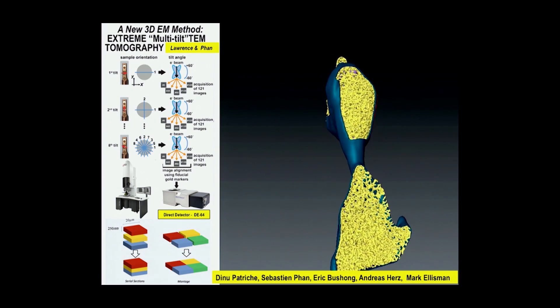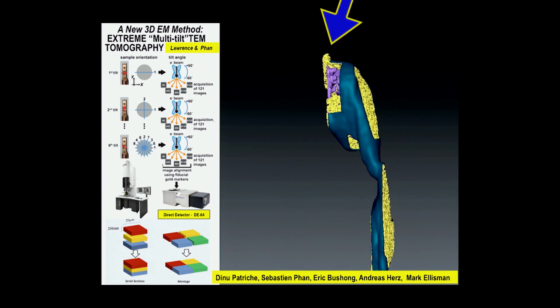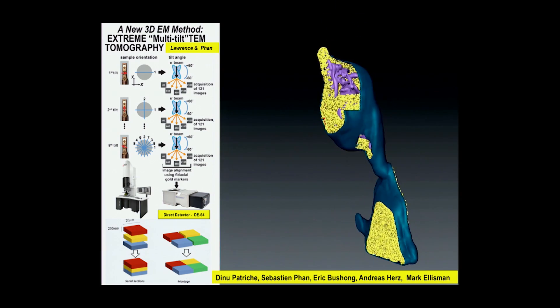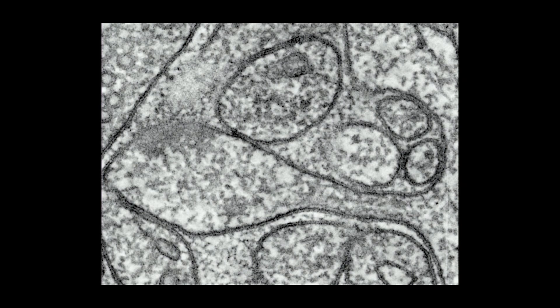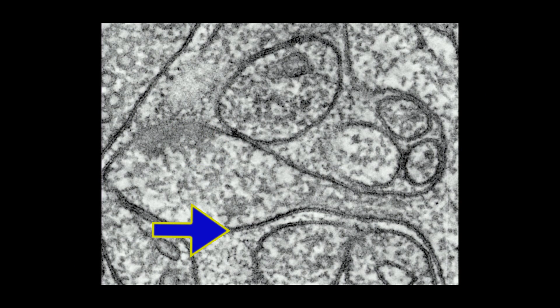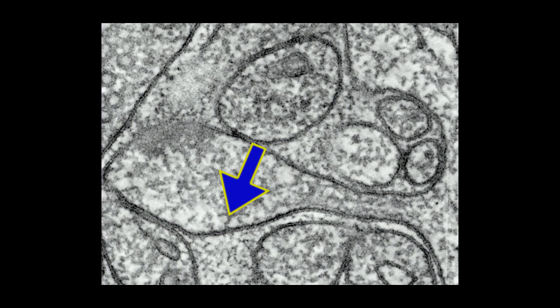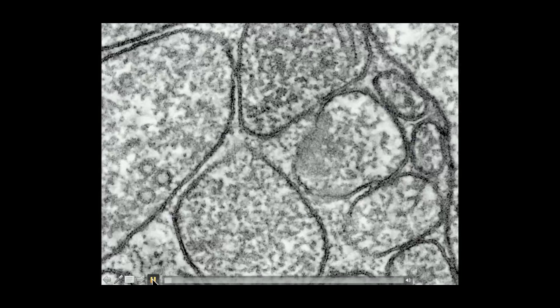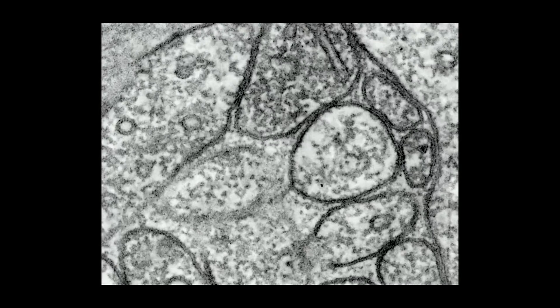If you extract the dendritic spine from that volume after using some fancy tools to follow the actin, that's what it looks like — that's the postsynaptic density, a little finger-like process probably trying to extend. Here is a more recent one with something called the direct detector, which we invented at the center. Here's the spine head, neck, and shaft of the dendrite. These are actin polymers — the little balls you see are actin monomers. Here you can even see membrane proteins in the membrane, and then extracellular matrix — perhaps the perineuronal net — which you can see actually connects from the extracellular space through proteins in the membrane on into the cytoskeleton.